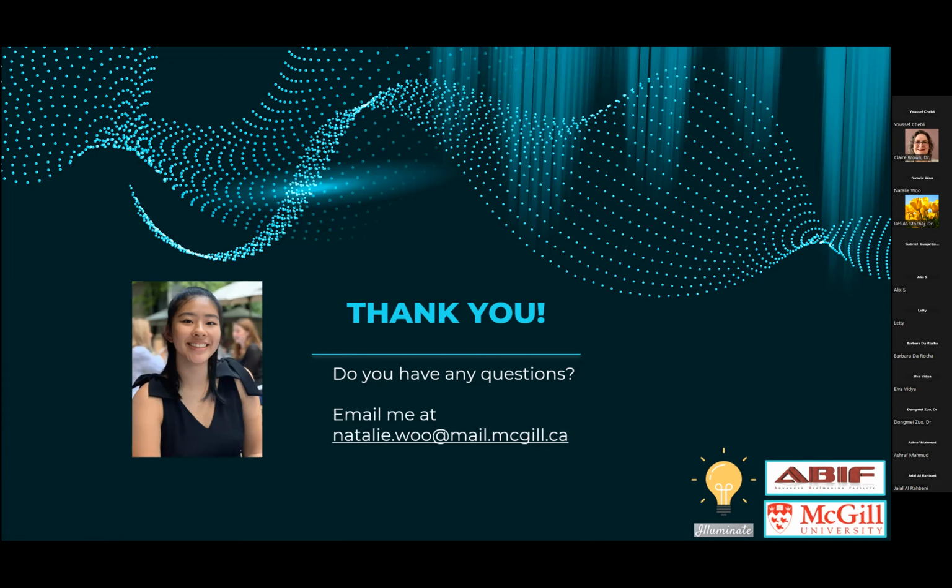Oh, like what just happened last week? Okay, yeah. So somebody in our audience asked what kind of difficulties are faced after expansion, handling the sample and then imaging it. Personally, what happened for mine was I expanded it and didn't expand it in the dish that I wanted to image in. And so I had to move it.